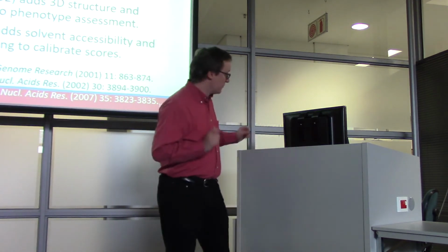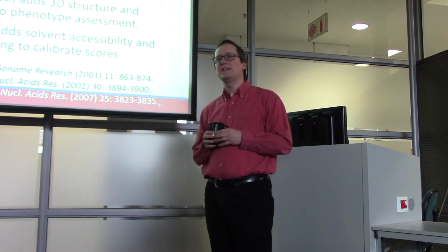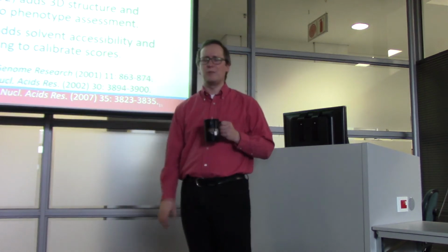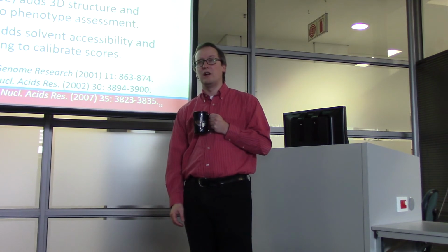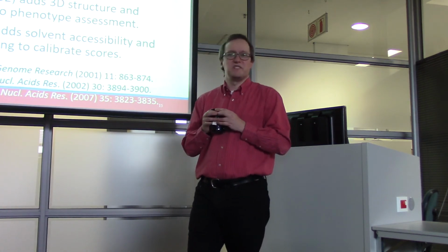Okay, now, having found a sequence variant, we would like to know whether that's a meaningful one or not. So I'm going to step away from 16S for a moment. I've spent a lot of time yammering on about that. Instead, let us imagine that we are sequencing genes associated with drug resistance in infectious disease.